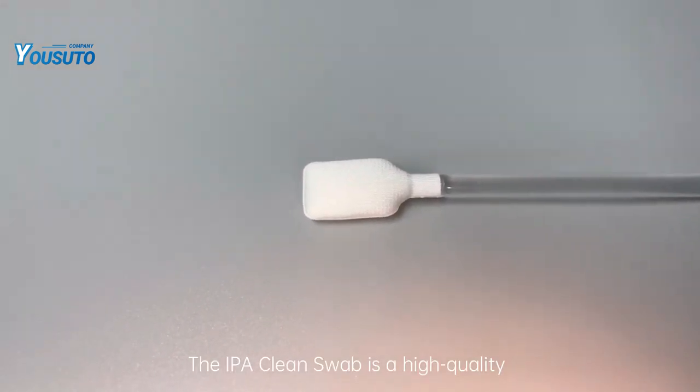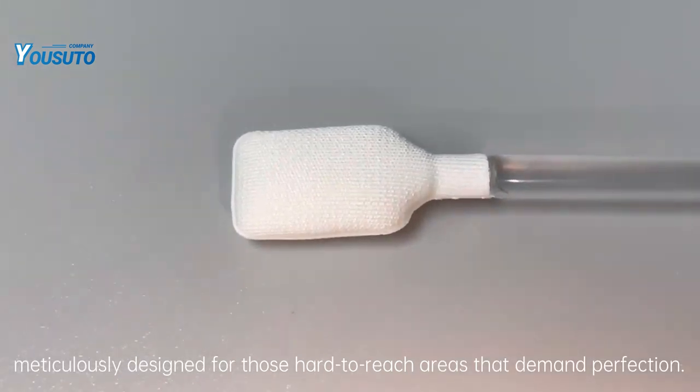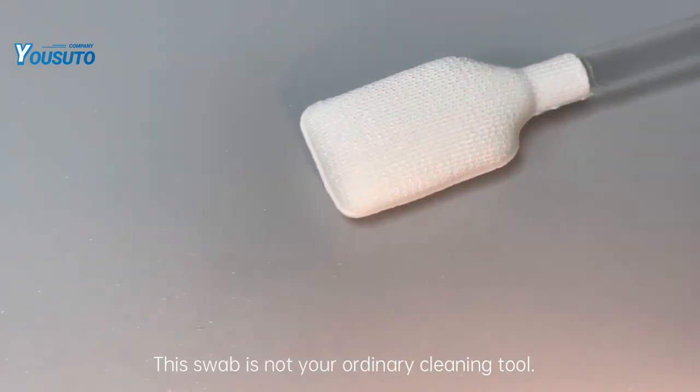The IPA Clean Swab is a high-quality cleanroom swab, meticulously designed for those hard-to-reach areas that demand perfection. This swab is not your ordinary cleaning tool.